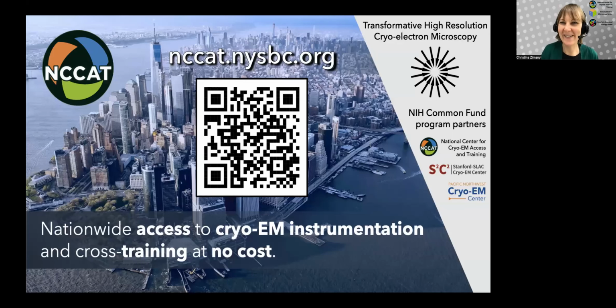Hello, I'm Ed, the manager of NCCAT here in New York. We have 4 dedicated Krioses for high-end data collection, a robust grid preparation screening service with applications for chameleon access, a blot-free vitrification device, and a robust cross-training program.